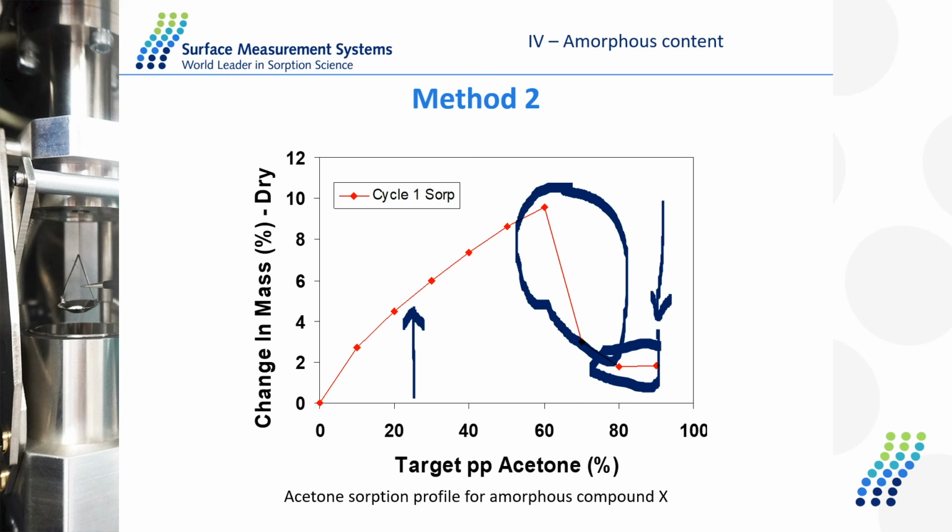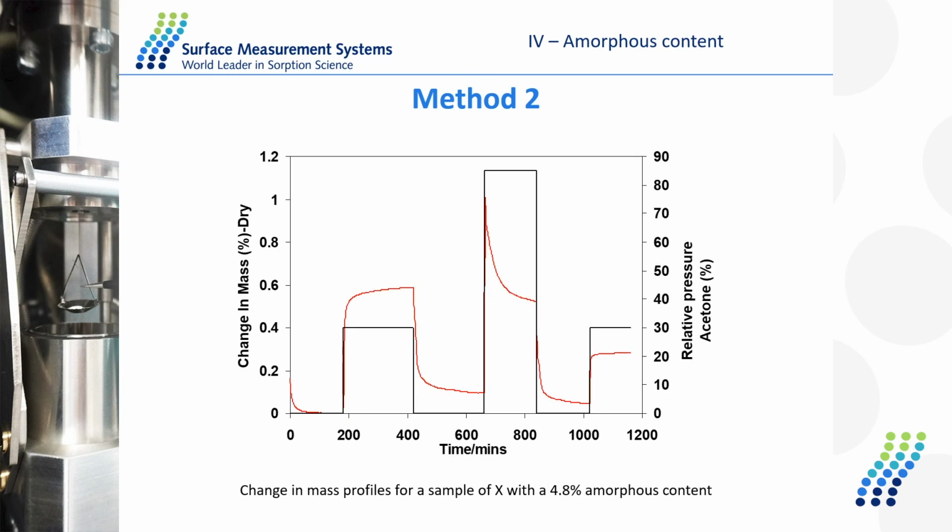So what we do in the next stage is take a fresh new sample and repeat the study that we have done in this way. We start from 30% relative humidity, partial pressure, sorry, right here, and we measure the mass change at 30% of the amorphous because there is no crystallization yet. Then we move to 90% right here, and you can see at 90%, the material moves from amorphous to crystalline. Perfect. Now we go back to 30% in the third stage, and you can see the mass uptake is much lower compared to what we have in the first stage.